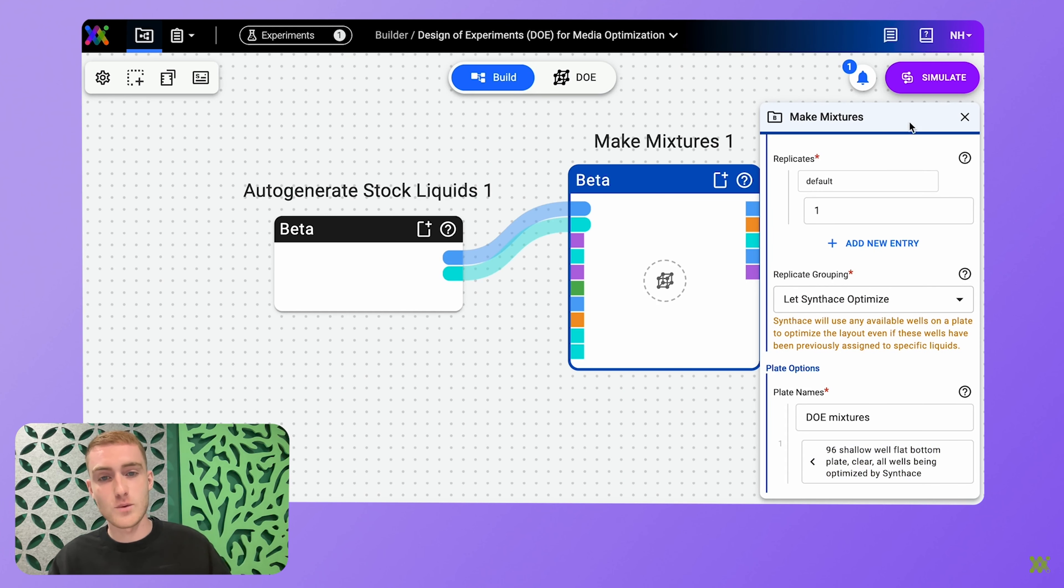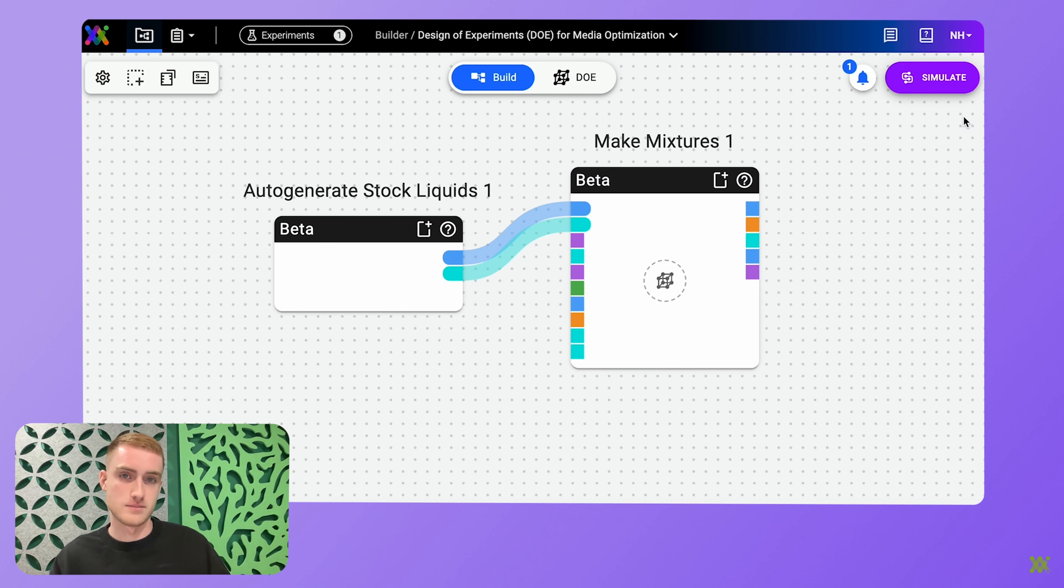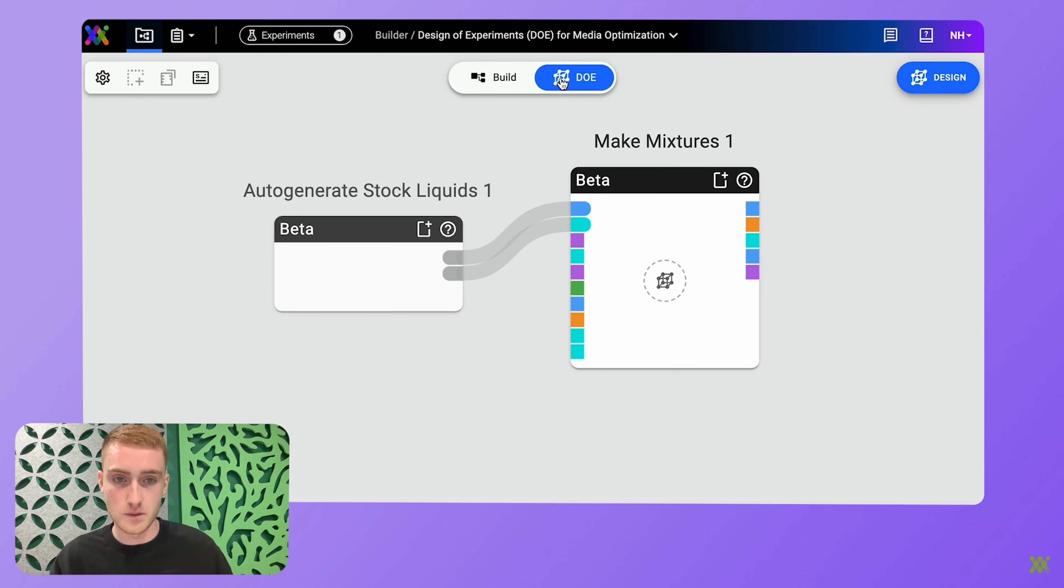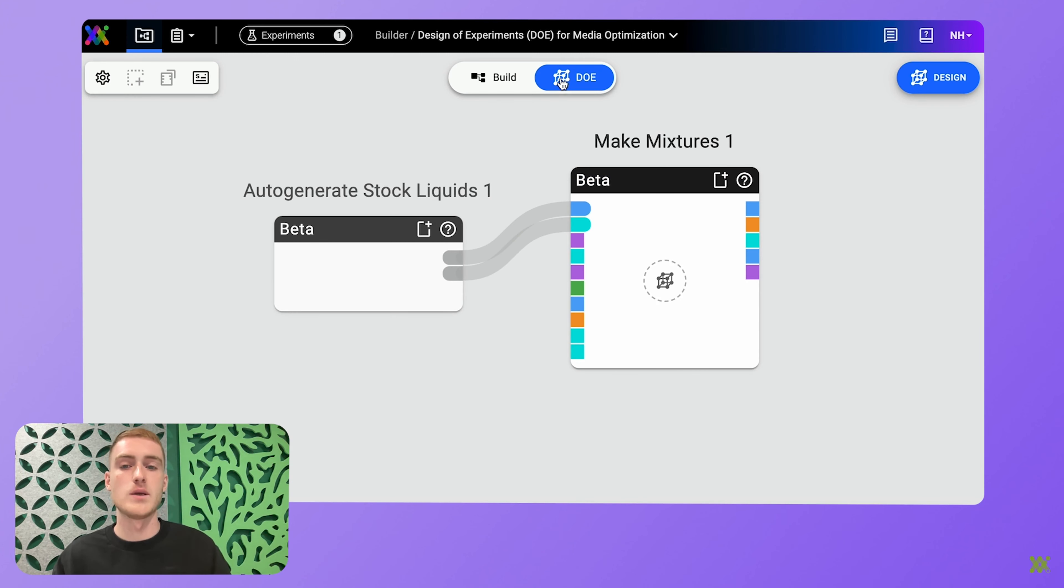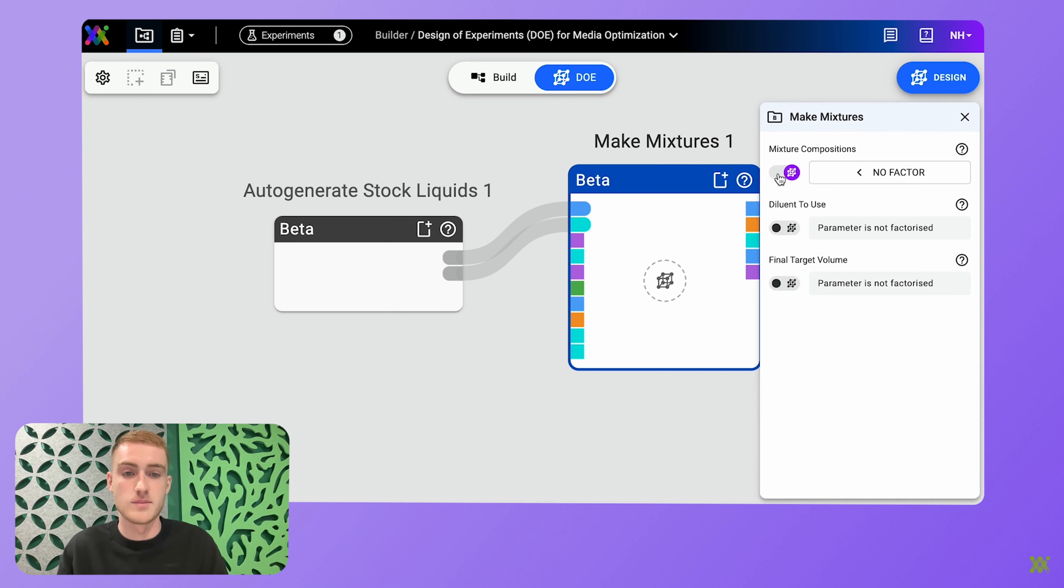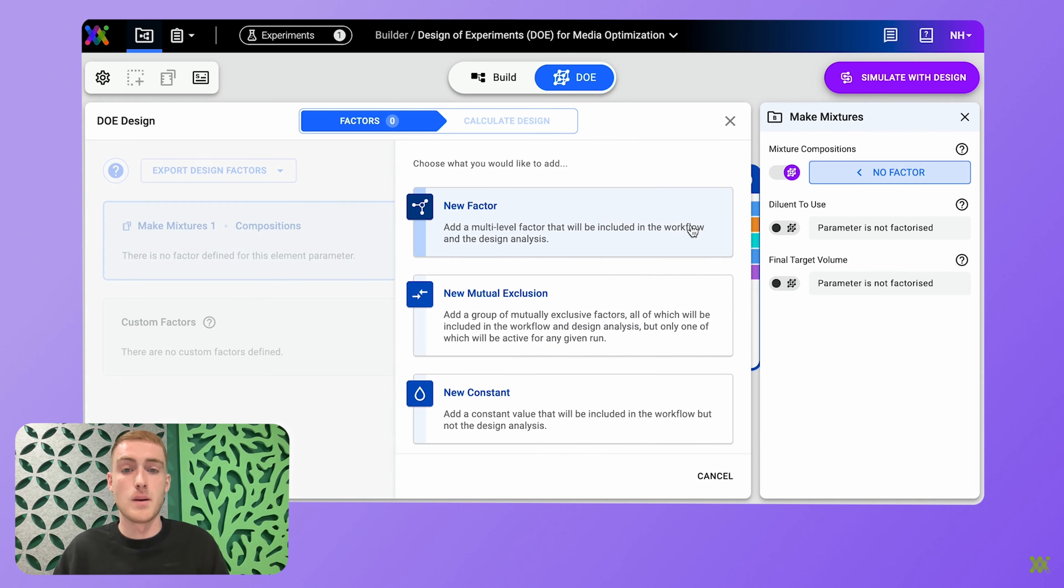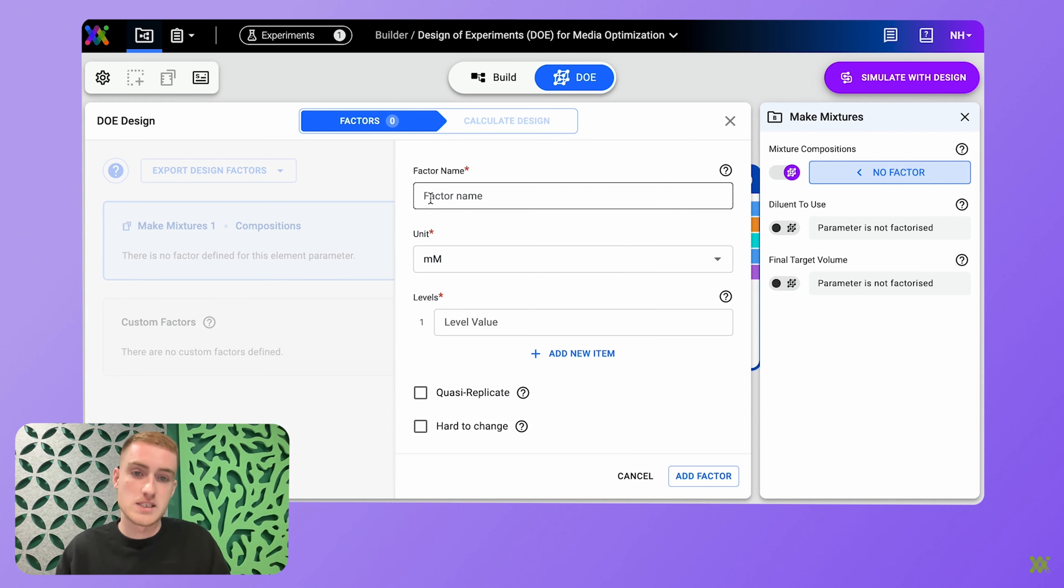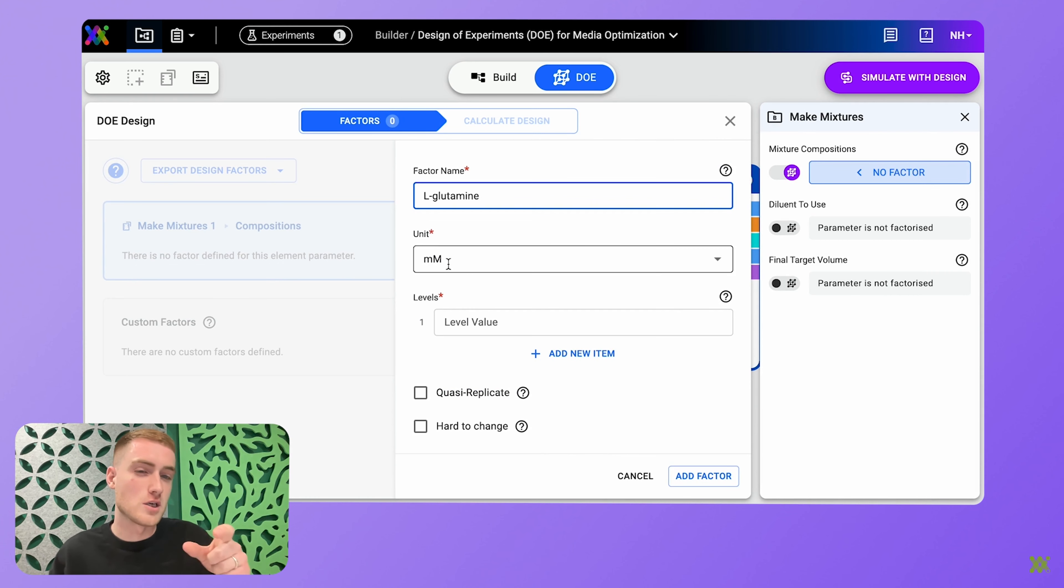But this is where it gets neat. I can then toggle into DOE mode. And this highlights all the stages in which I can apply a DOE design in my experiment. In this case, I'm going to add the DOE design to my mixtures and specifically my mixture components.